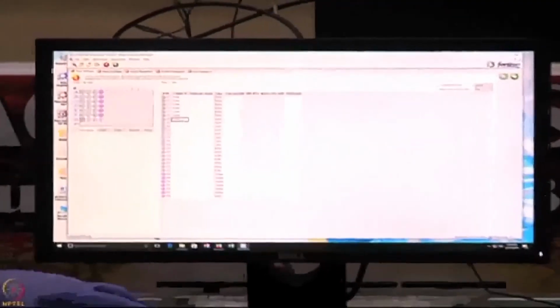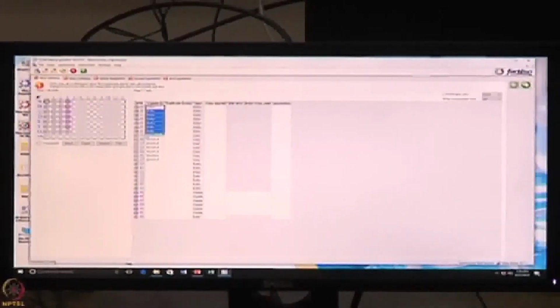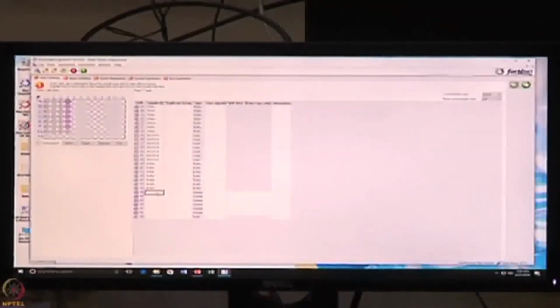We have to feed this in the template. In the sample ID, what you feed is the buffer. Control C, it typically looks like an Excel sheet. Then the load, you have biotin protein A. Then once again you have buffer, right? Control C, and then you go with the buffer. Then you have mouse IgG.